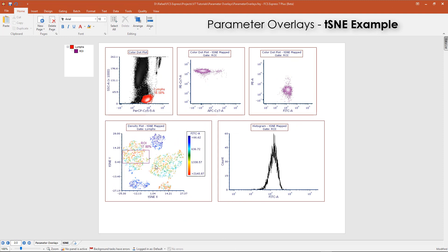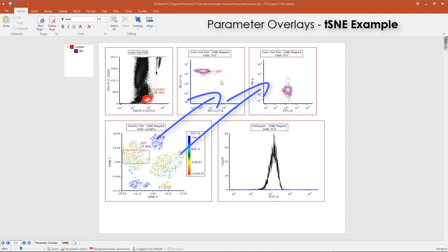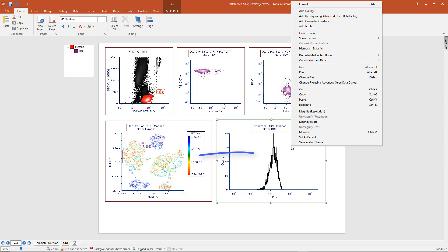Parameter overlays can also be used to visualize and explore transformations like tSNE. In this example, a tSNE cluster has been gated and its staining pattern visualized across multiple two-dimensional plots. With Parameter Overlays, we can more quickly explore this gated tSNE cluster across multiple parameters on just a single histogram.